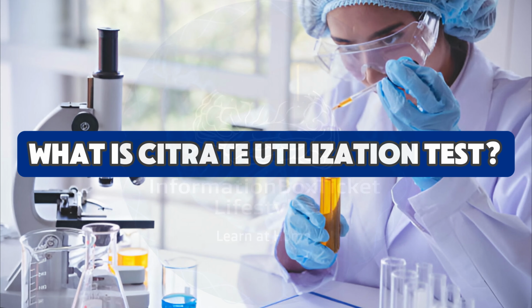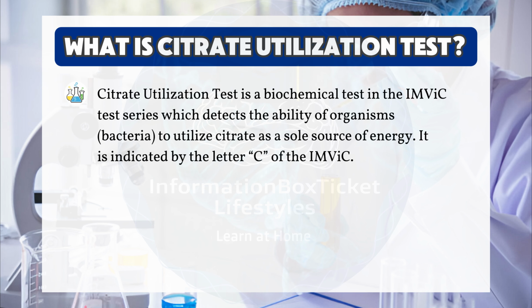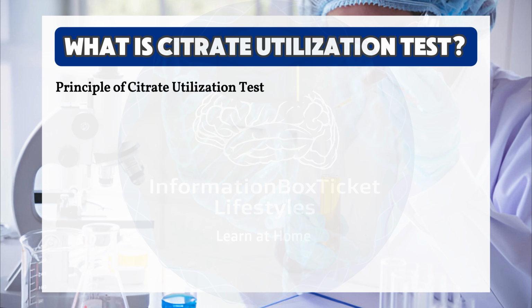What is citrate utilization test? Citrate utilization test is a biochemical test in the IMViC test series, which detects the ability of organisms, bacteria, to utilize citrate as a sole source of energy. It is indicated by the letter C of the IMViC. Principle of Citrate Utilization Test.